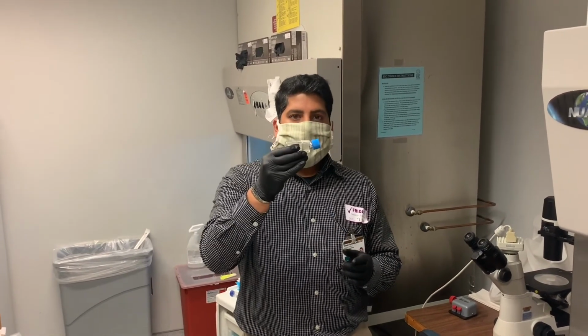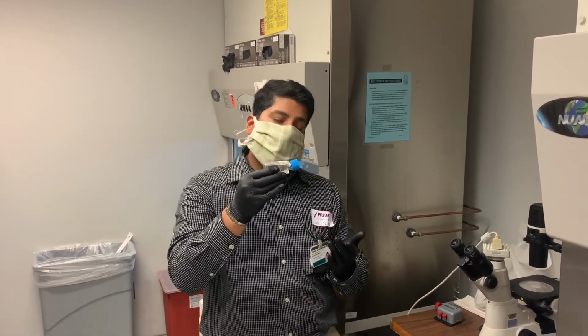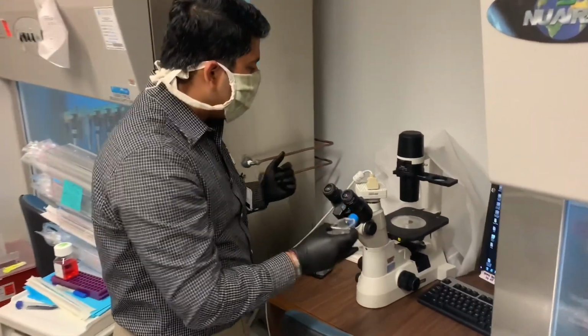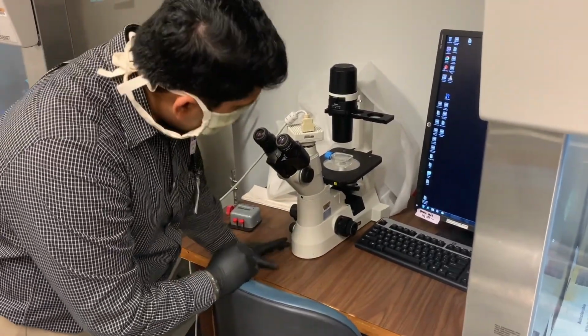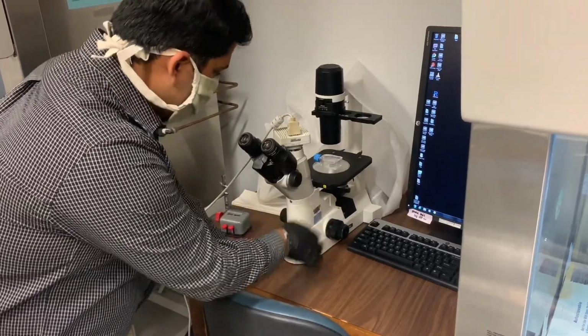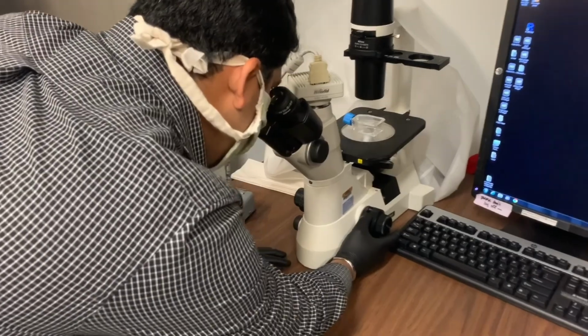So here we have a flask that has cells on the bottom and media on top. So how do we look at them? Well, what we do is we put them on the plate here on the microscope, and using light that shines through the microscope, we can look through the binoculars and see the cells underneath.